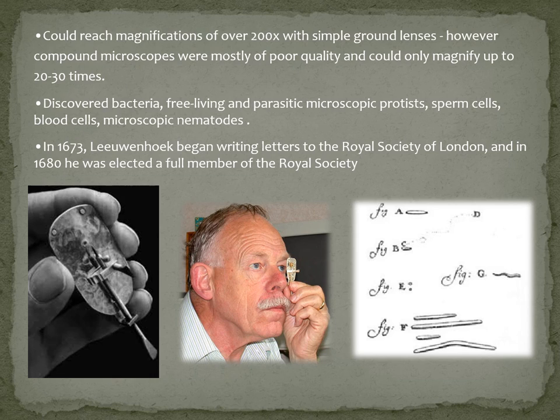And as you can see from these images, and in particular from this one, this is not a really simple microscope to use. It's not so simple to do observations and then draw cartoons out of them. Nevertheless, they had a great advantage over the compound microscope of the time: they were easy to position according to the source of light.